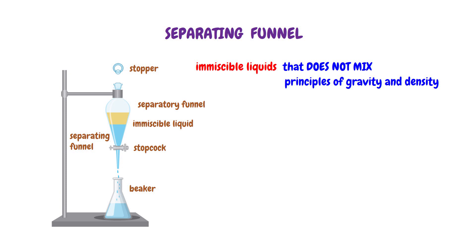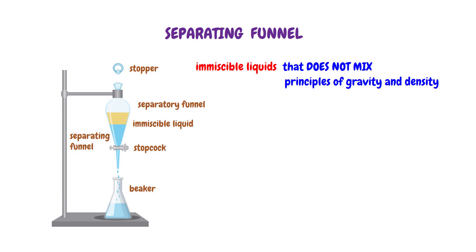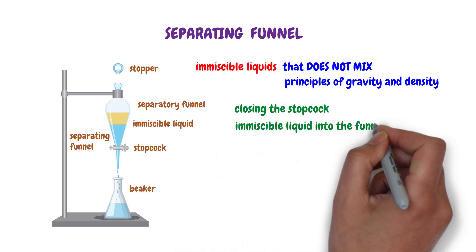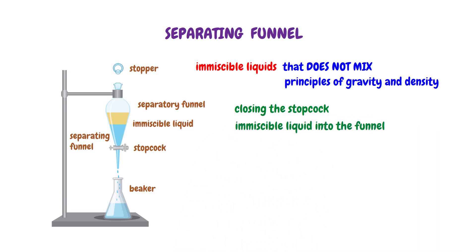To employ the separating funnel technique, begin by closing the stopcock of the funnel. Carefully pour the immiscible liquid into the funnel and seal it with a stopper. Allow the fluid to settle. The denser liquid will gravitate to the bottom while the less dense counterpart will remain atop.